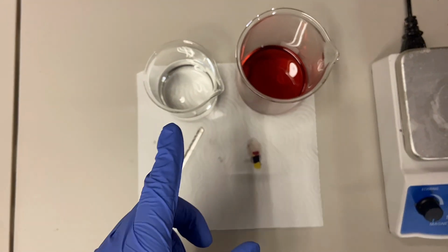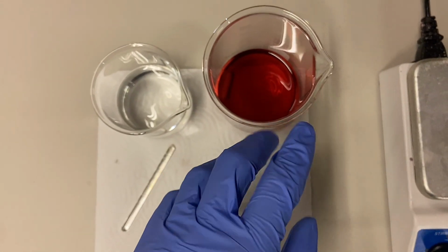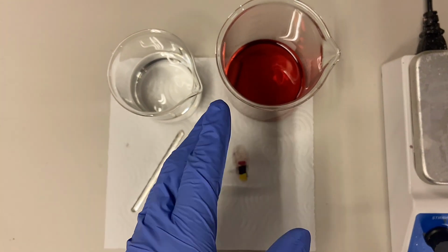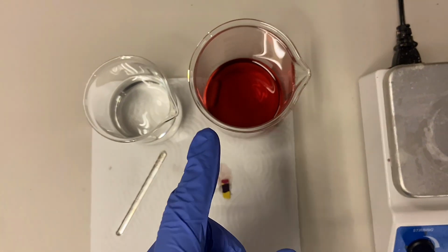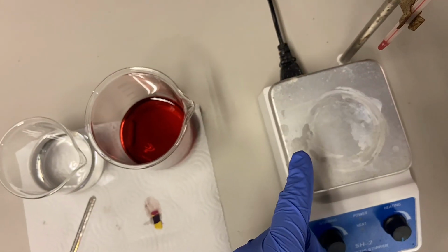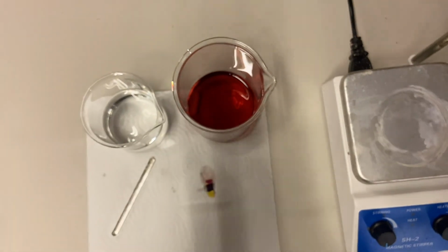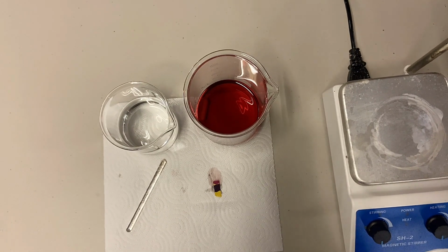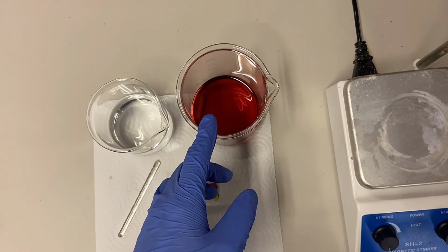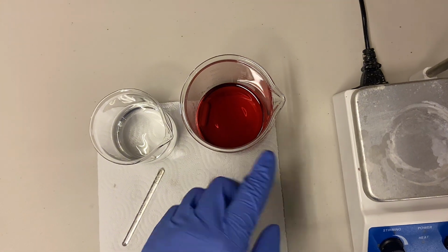Now, what I'm going to do is slowly add this into here until this is pretty much a neutral pH, sitting around 4 or 5, slightly acidic, near neutral. And that's what's going to be best for the manganese extraction, because once it's neutralized, I can heat it up to just below boiling and add an oxidizing agent, which will oxidize the manganese out. That'll come out as a solid precipitate. I can filter it, and then I'll just be left with this liquid. It'll still be a red color, and it will have cobalt, nickel, and lithium in it, and nothing else.